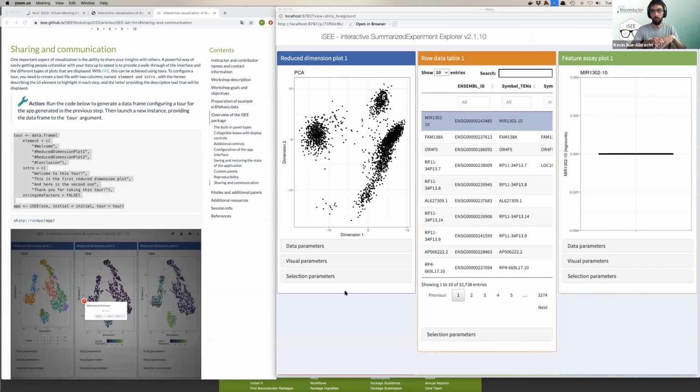At some point, I took some variant data and ran a PCA on it. It's not the most exciting when you've got binary data. The variant plots and everything get better with continuous data, like gene expression. But anything you can think of and fit in there.